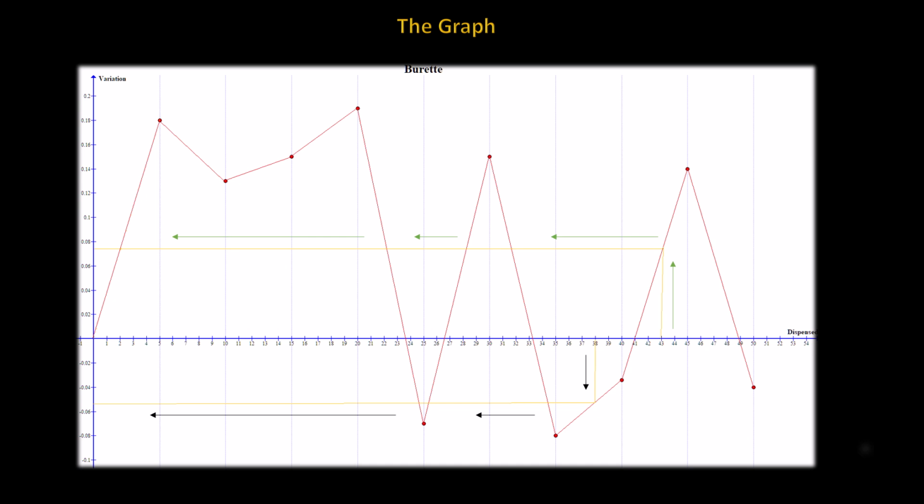It would also be enough to state that the estimated volume falls well within the rated specification of the burette, and that there are no specific environmental effects associated with the burette's matrix. This process of evaluation and glassware calibration can be used for all glassware, and the correction table would be used to correct the volume estimated at different temperatures.